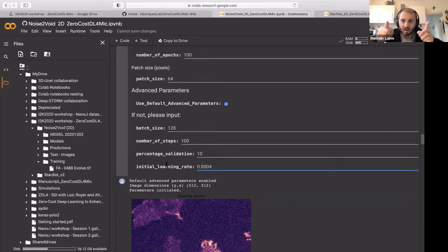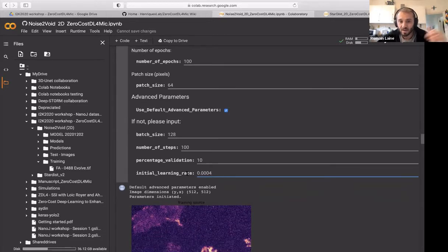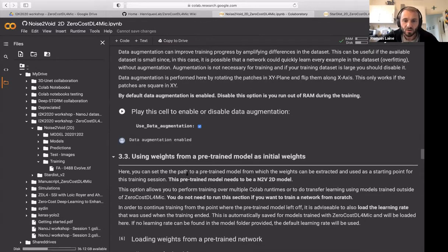So it takes finer and finer steps automatically during training, and that's done under the hood without you having to control this. In the majority of cases, the way this is handled by the network works really well. It decreases automatically in a way that allows for finer and finer tuning efficiently. Sorry, does that answer your question as well?